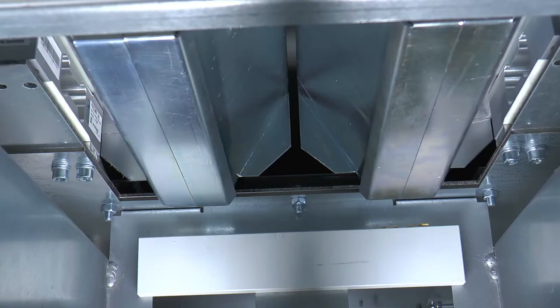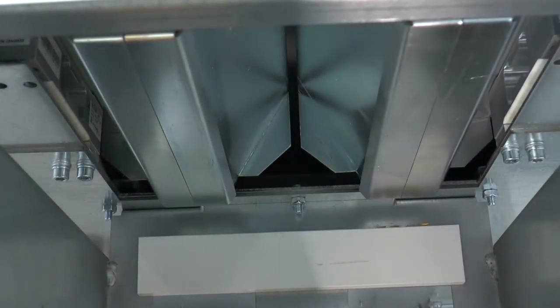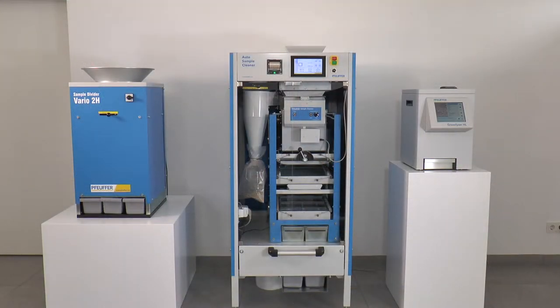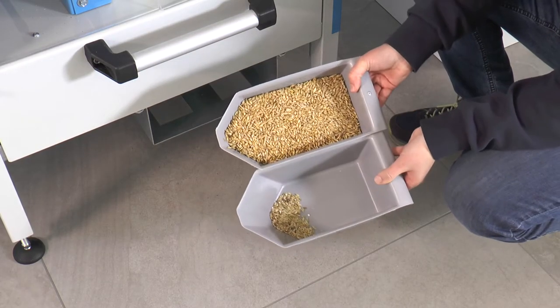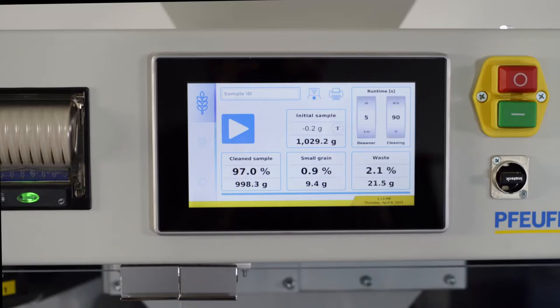After the sorting, the quality grains fall onto the right balance, and the shriveled grain onto the left. The automatic sample cleaner weighs the two fractions, calculates the percentages based on the initial weight, and clearly shows them on the display.